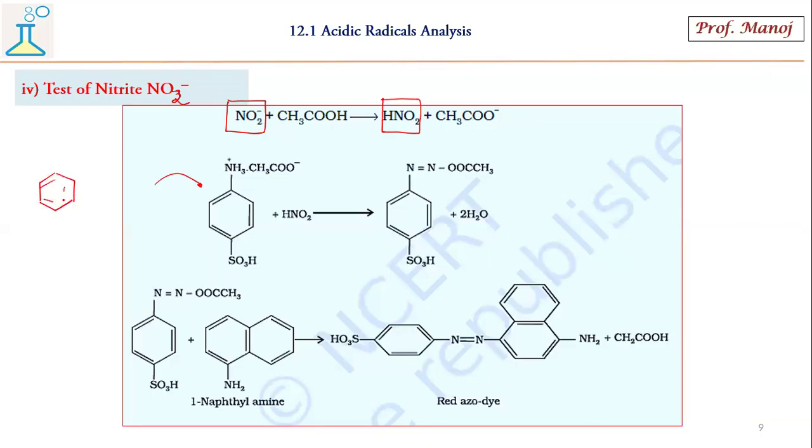They have shown the form which is changed. Anybody remembers the name of this compound? This is the original form which is reacted with acetic acid. This H plus has gone here to form NH3 plus, and the acetate ion has remained here as a bipolar ion.